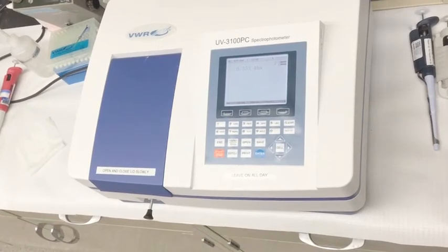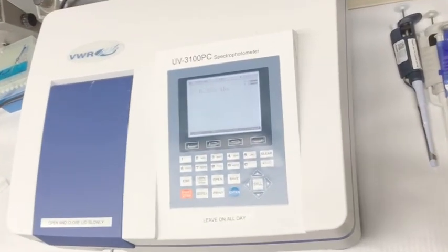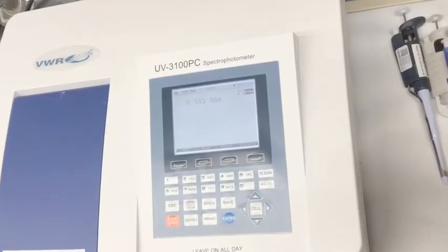At this point, the absorbance should have changed. Write down the absorbance in your lab notes.